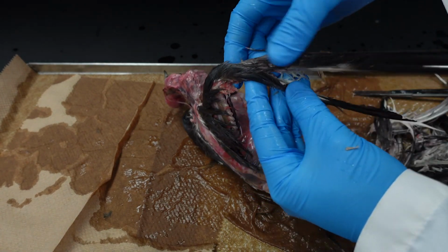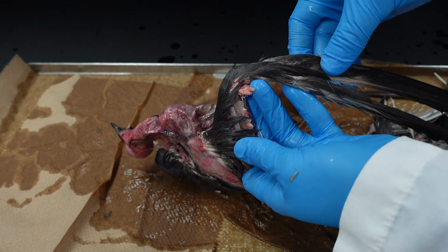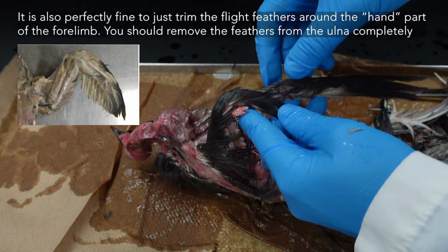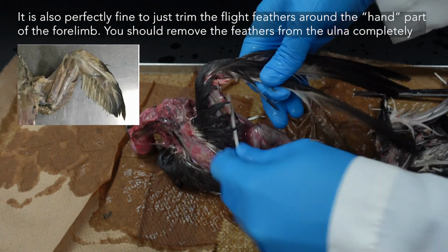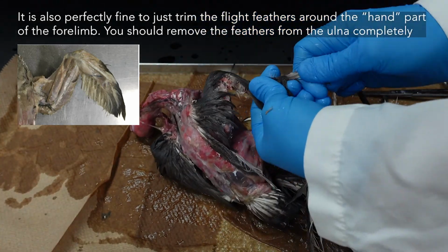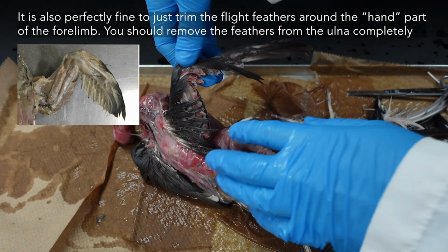For the end, as we're looking towards the fingers of the bird, the little reduced phalanges, you do want to be careful. You don't want to take those off. So at this point, maybe take just one or two flight feathers at a time and take them out. Now we have the wing without the flight feathers.